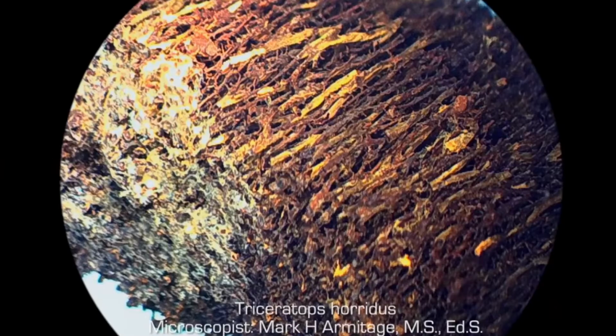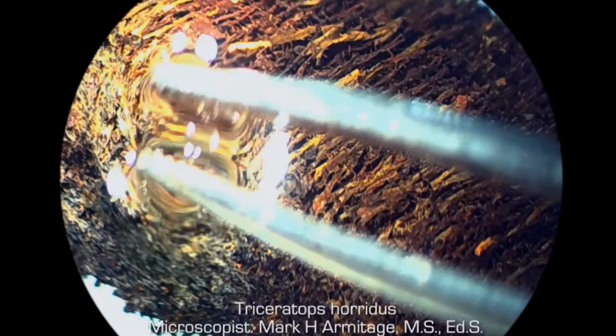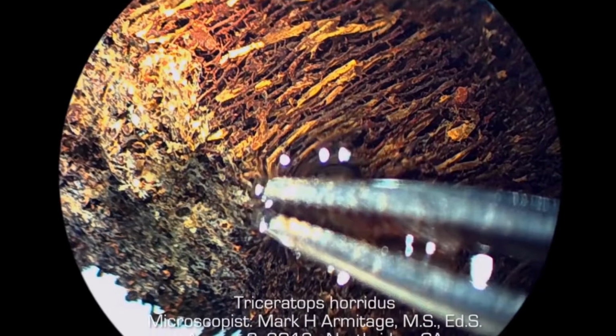Horn magnified. Well, Kevin, what did you find when you were looking at the sample and you actually found some tissue? Okay, here's what we found. Here we have a piece of the horn that has been decalcified, like what I just showed you over on the bench. Mark Armitage was our microscopist working on this. And Mark then took a piece of the decalcified horn and put it under a microscope.